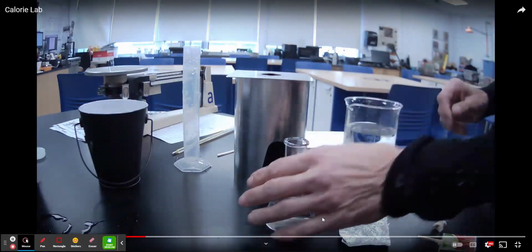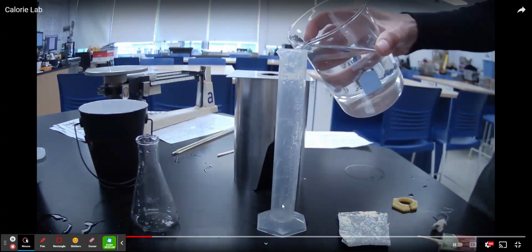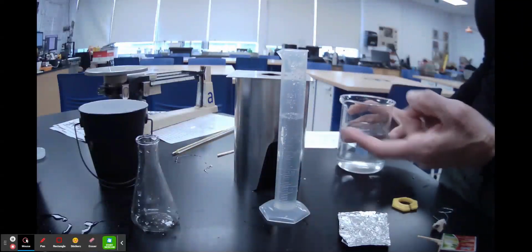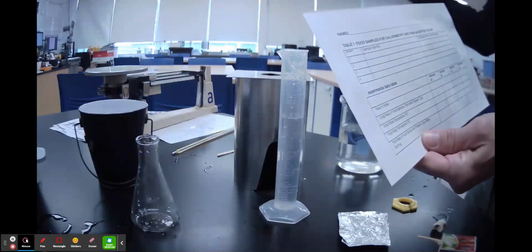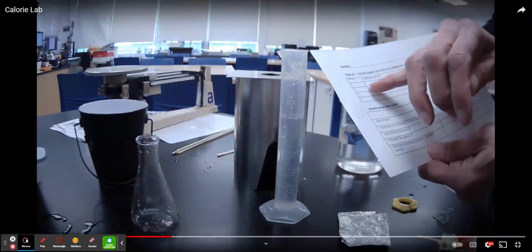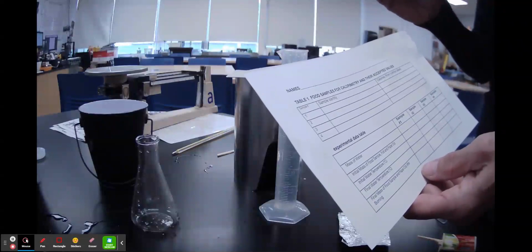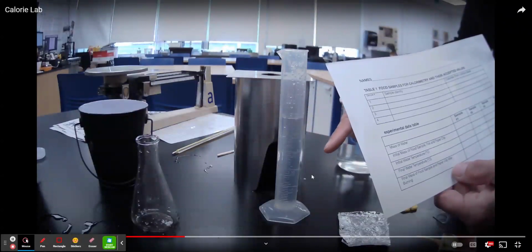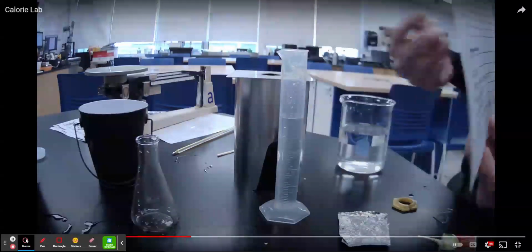Okay, so make sure that your Erlenmeyer flask is dry. You're going to use 50 milliliters of distilled water. In your data sheet, you'll see it says mass of water. You do not have to weigh the water. You are going to use the fact that 1 milliliter equals 1 gram. If you have exactly 50 milliliters, you have 50 grams of water. You're also going to get one of the 4 food samples and write the sample identity as well as the calories per gram for that particular food sample. Once you get your 50 milliliters, looking at it so that the meniscus is at the 50 milliliter mark at eye level, you're going to pour that into the Erlenmeyer flask.